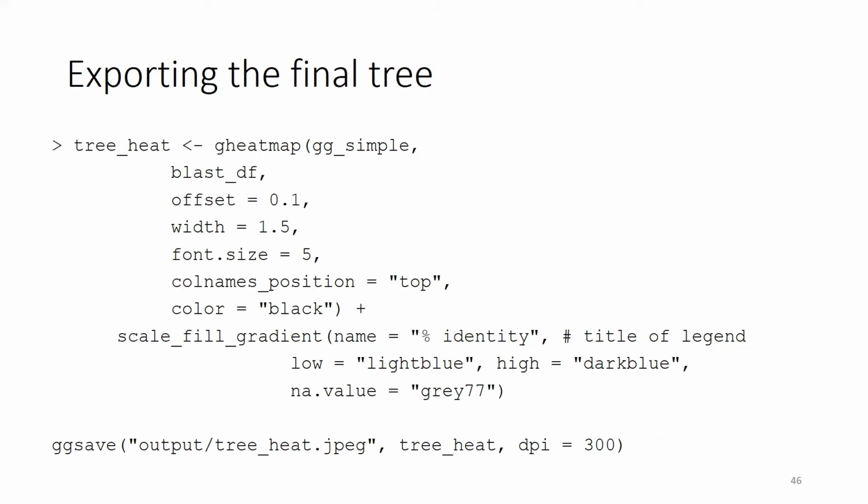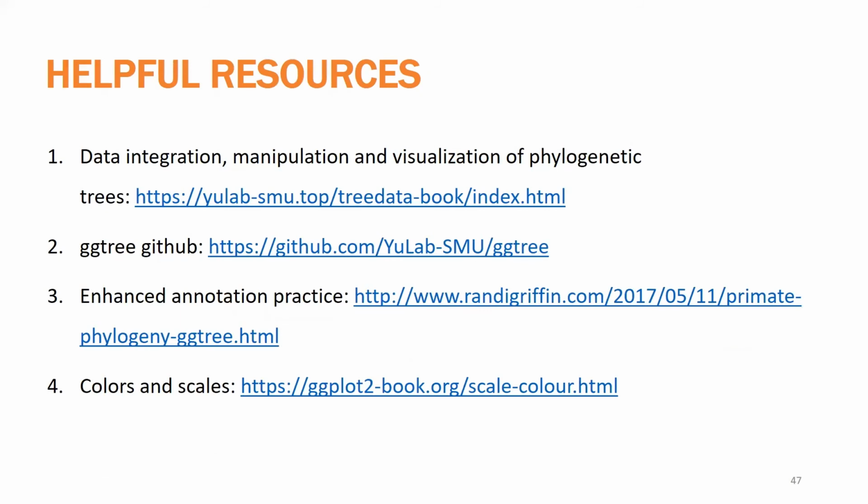But that's pretty much the end of the road. Those are some of the basic steps that I use, and I encourage you guys to check out some of these resources, definitely the book. Follow along with some of the tutorials, and you can build and make some very cool trees closer to the publication one that we saw in the journal.